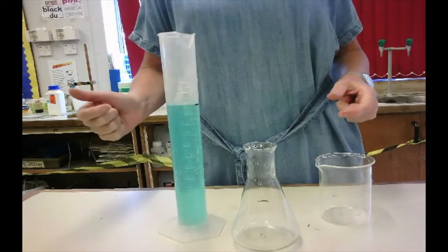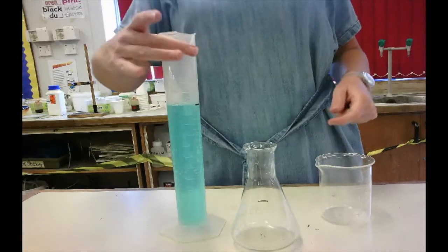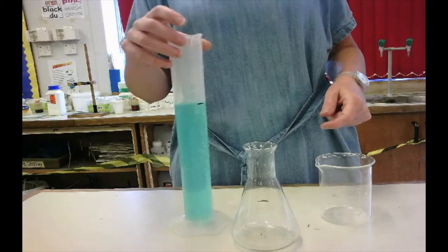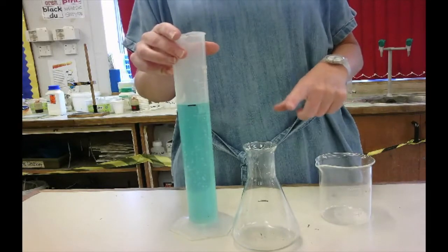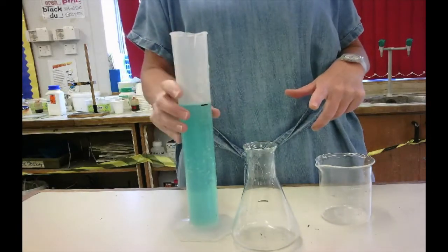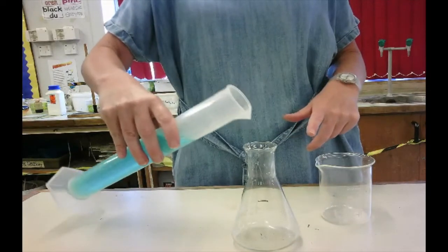Now, it's a liquid, the short experiment in your book. I've got 200 centimetre cubed of a coloured liquid in this measuring cylinder. I put a black mark there so it's easier for you to see. It's 200 centimetre cubed or 200 millilitres. And what I'm going to do is pour this now into a conical flask.